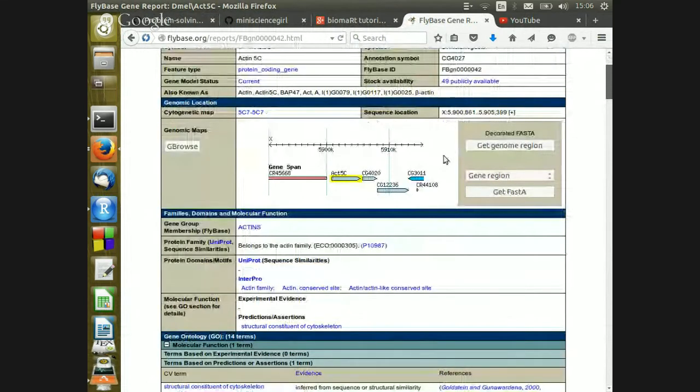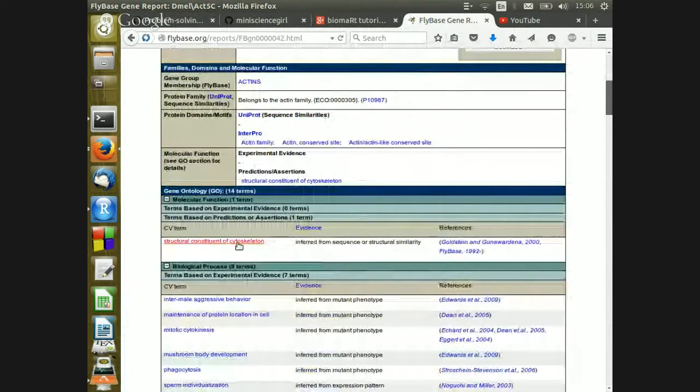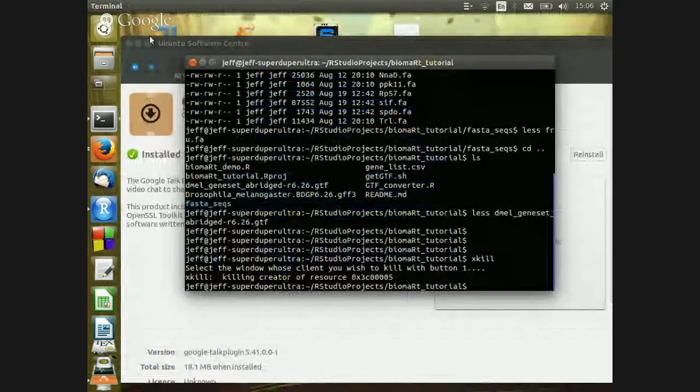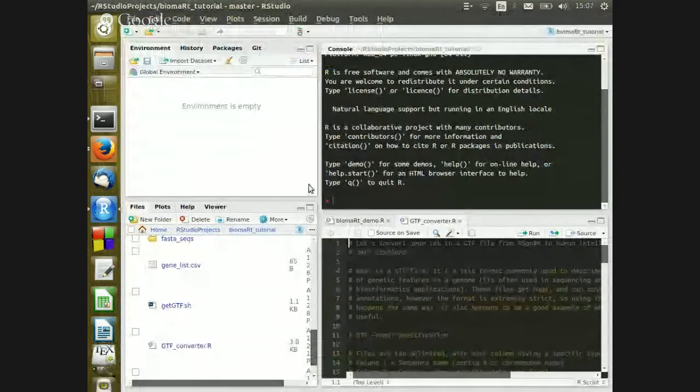Like, say you want to convert between gene IDs, or you need to grab gene IDs, you can do that. You can also grab stuff like what GO terms it's got, and where the gene starts and stops in the genome, where it's located, the peptide sequence for every different transcript. You can get the coding sequence of the gene. It's really powerful, and we're going to go through a couple of examples, one of which was actually a real example that I did recently. So hopefully we should all walk out of here being able to use it. And if you need help with something, hopefully this package can actually solve some of those issues for you.